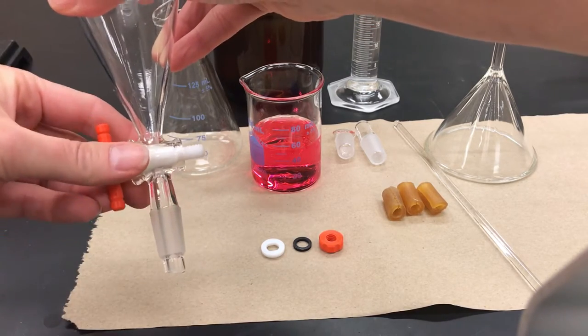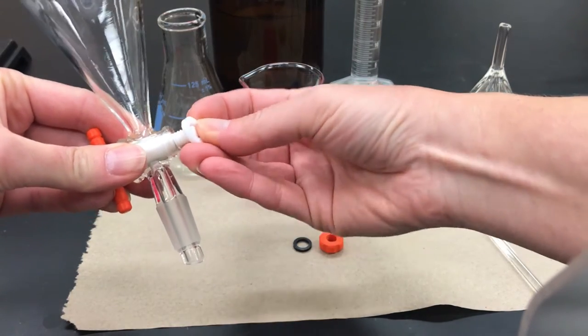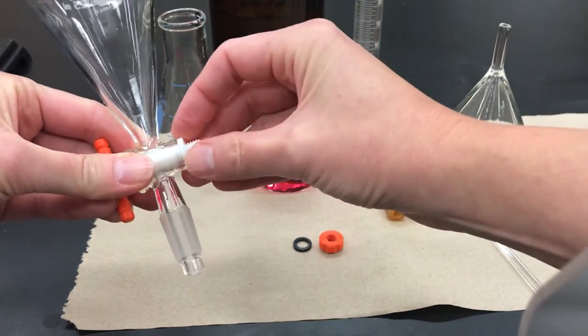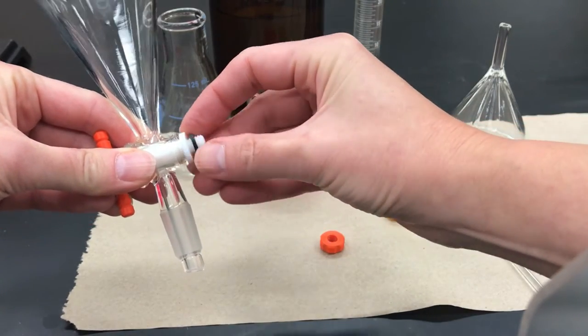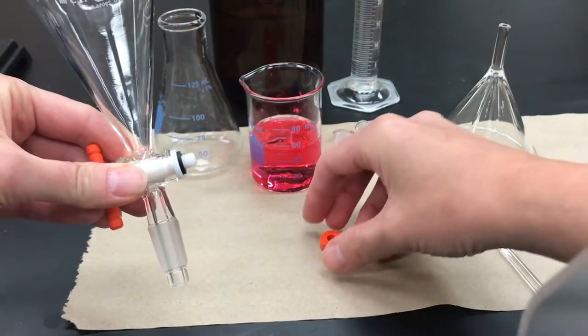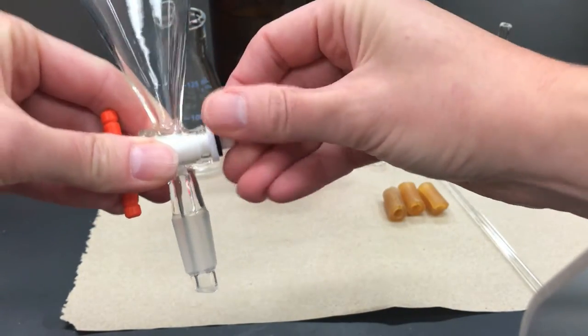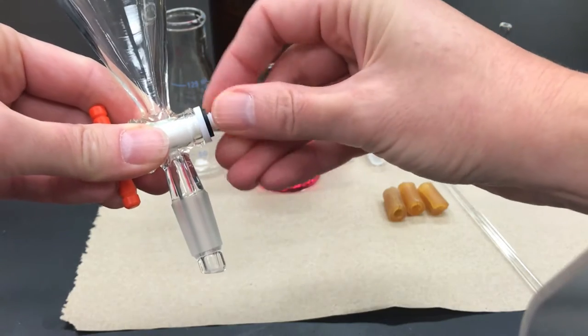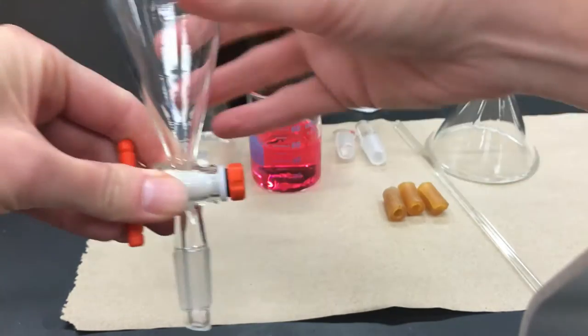If you have a Teflon stopcock, you're going to stick that in, followed by the plastic washer, then the little rubber washer, and then the plastic screw piece, and you screw that on until it's somewhat tight.